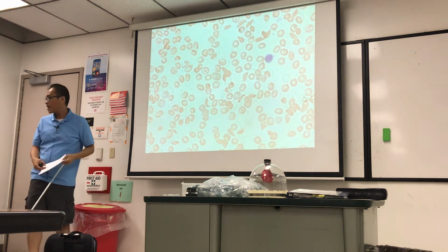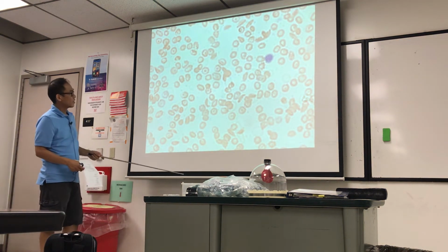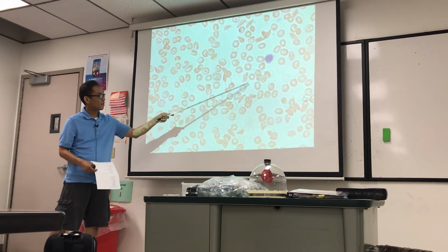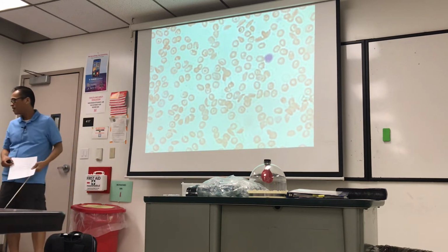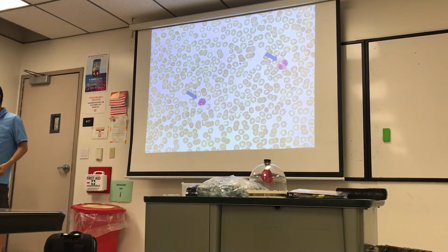Oh man. Now that is sickle cell anemia. So I just kind of look for the puckered cells there. There's many of them. Okay, I pointed to a few. Sickle cell anemia.